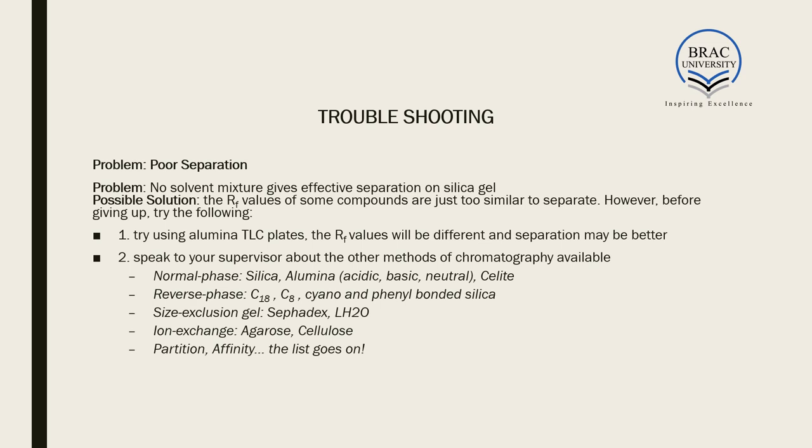Using alumina TLC plates may yield different Rf values and better separation. You can also consult your lab supervisor about other chromatographic methods available, such as normal phase, reverse phase, size exclusion, gel technology, ion exchange, partition, or affinity chromatography. If column chromatography is not giving the expected separation, trying different types of chromatography is always an option before giving up.